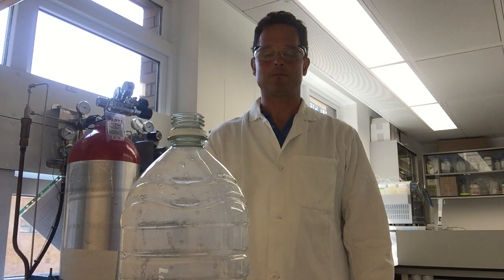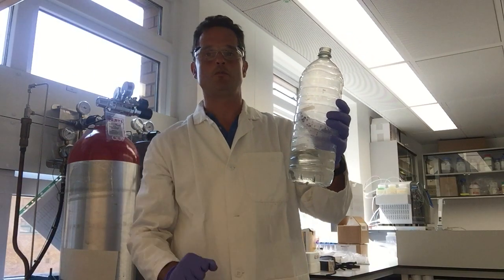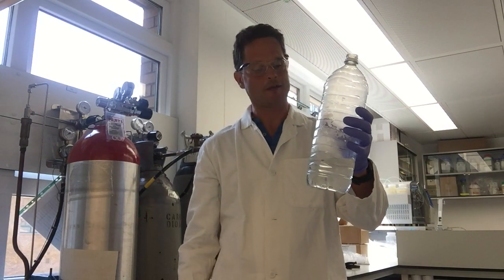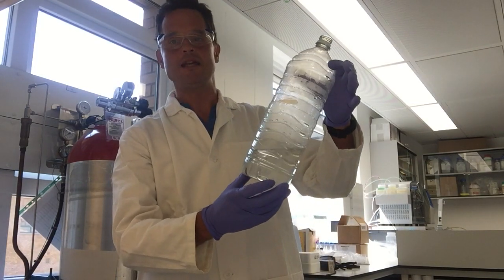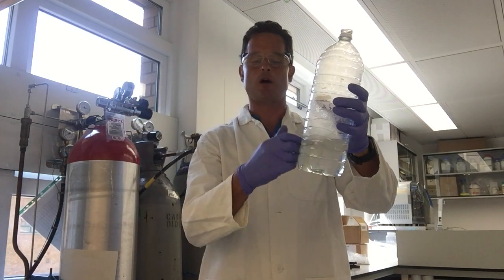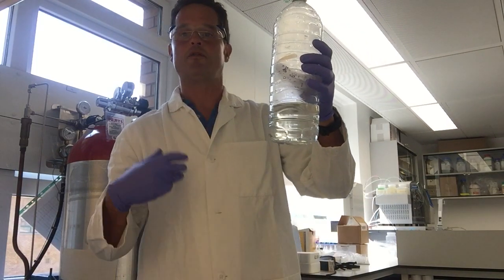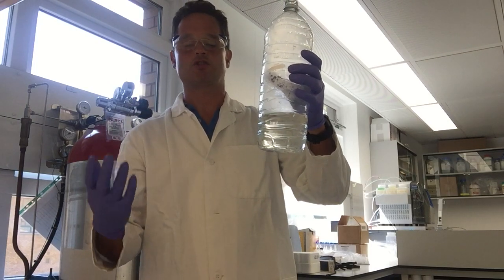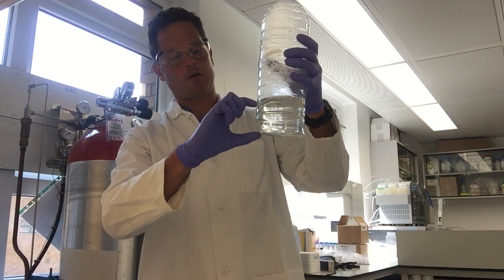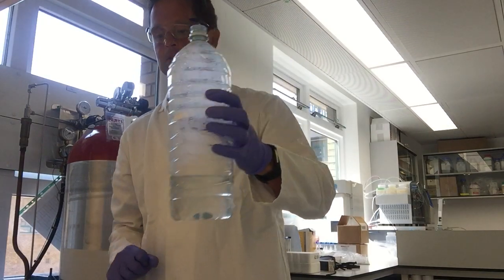So what I have here in my laboratory, and I do this in a fume cupboard to be safe, that's why I also have safety goggles and my lab coat on, is an empty PET bottle that was once full of drinking water, but I drank that water, and now I use it for my experiments. In that water bottle is a little bit of an alkaline, high pH solution. It's a sodium hydroxide solution, just a few deciliters of this solution in this PET bottle.